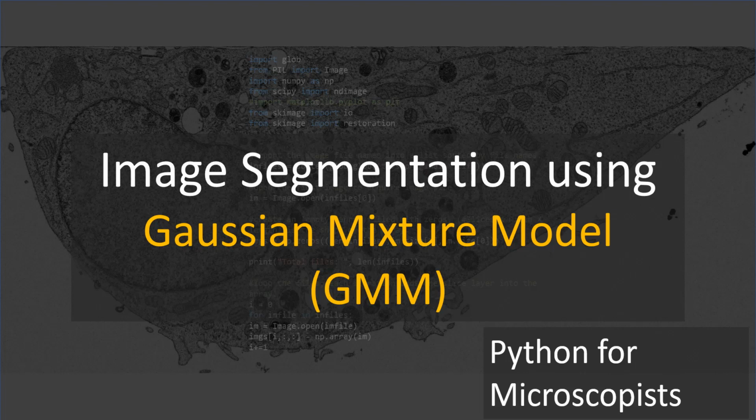So in the last tutorial, we talked about k-means clustering, for example. That's a good example for unsupervised segmentation because we have a bunch of data. In our case, because we are focused on image segmentation or image processing, our data is nothing but pixels in our image. Of course, this can be used for any data, right? So k-means is a good example of unsupervised segmentation.